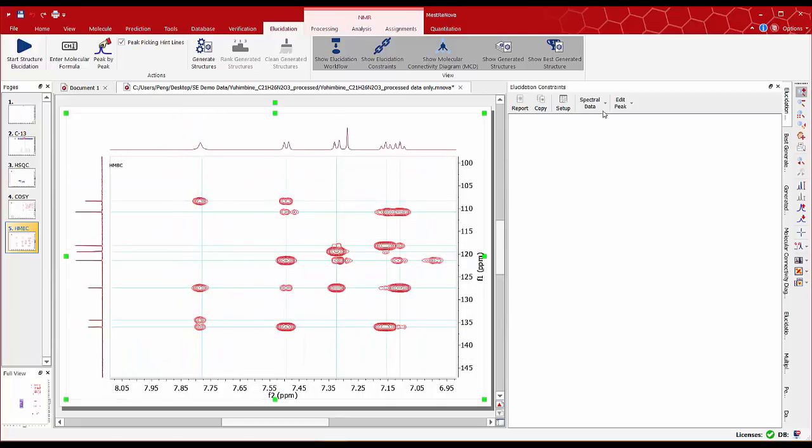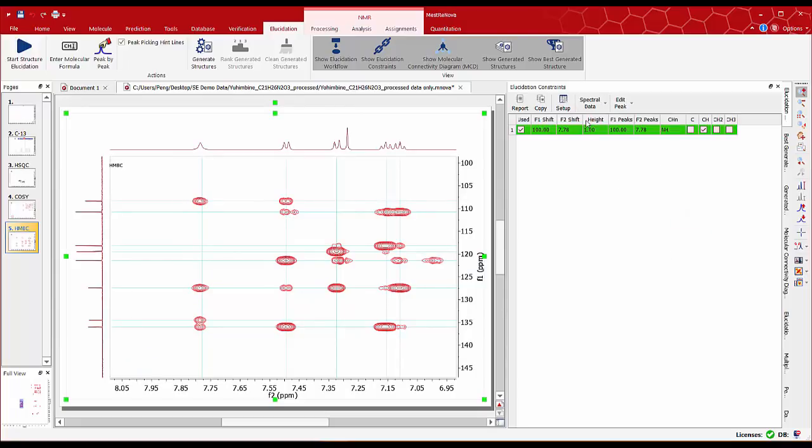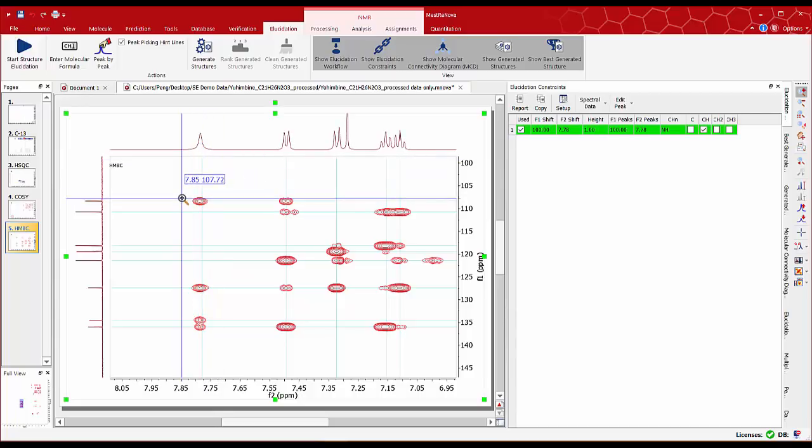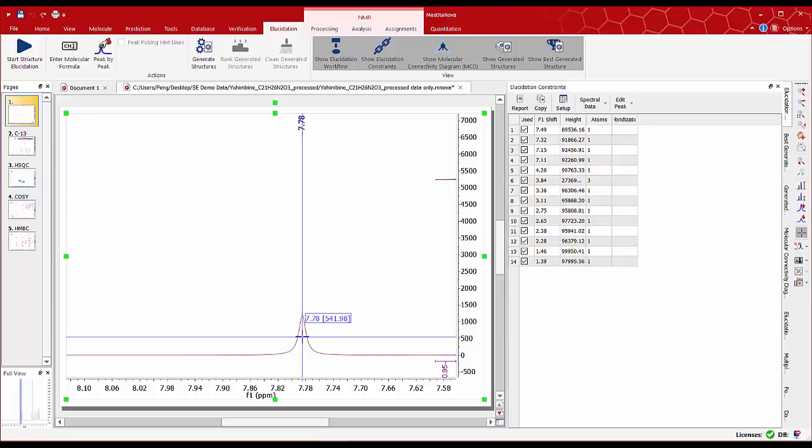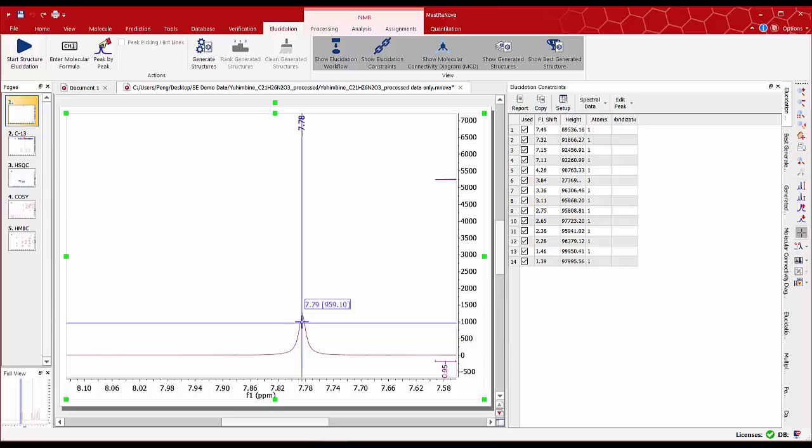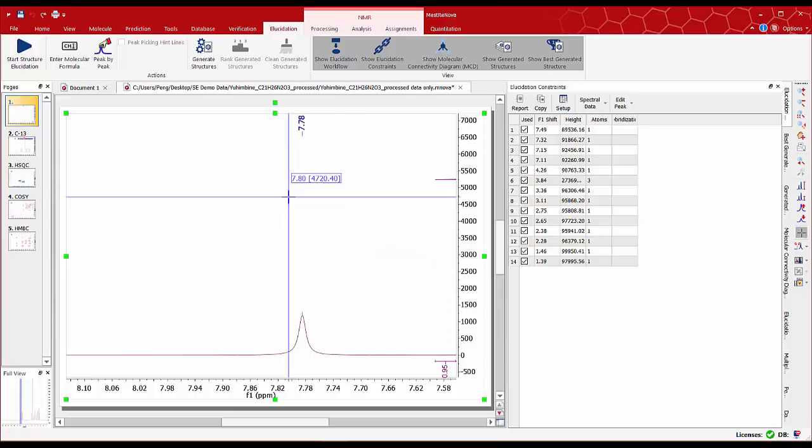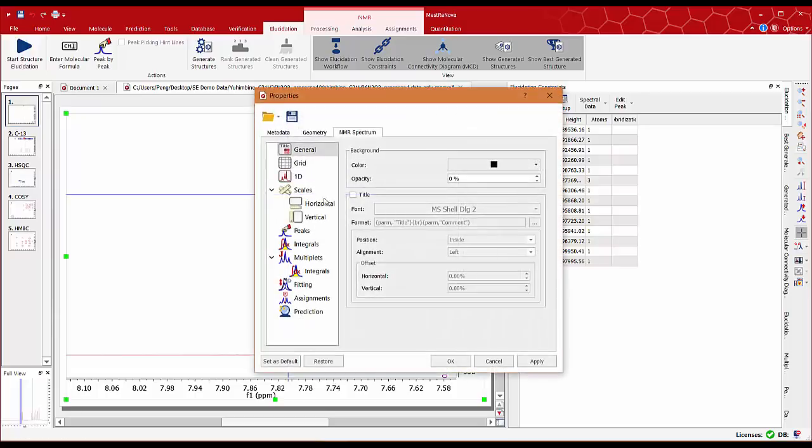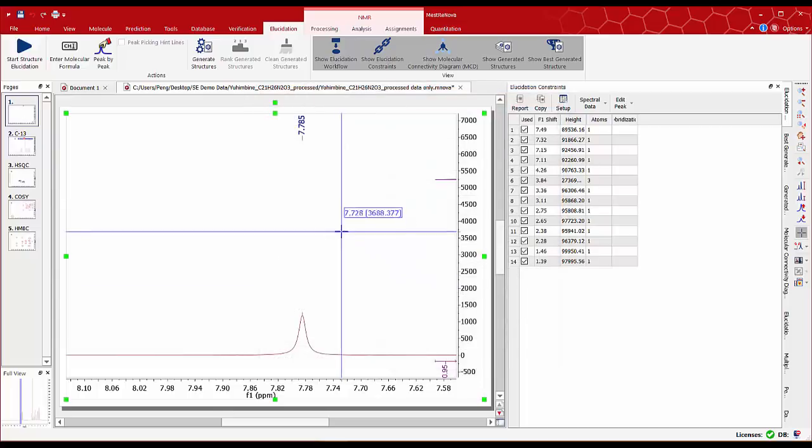Now we can see only one chemical shift coming from the elucidation constraint table that we've entered. This chemical shift is a little bit out of alignment so that we can fix it. We may need to increase the number of decimal places for it to fit properly. To do this just double click on the spectral window, go to peaks and type the number of decimal places we wish. In this case I'm going to increase to three decimal places.